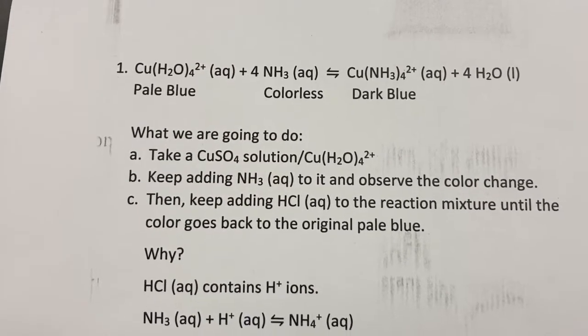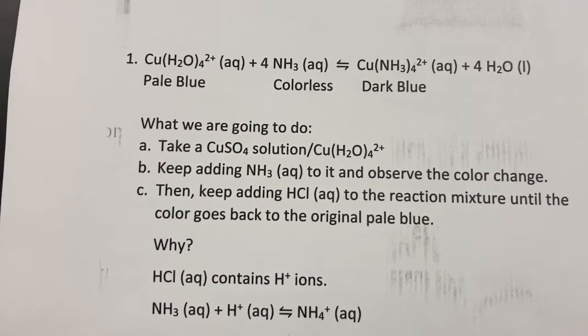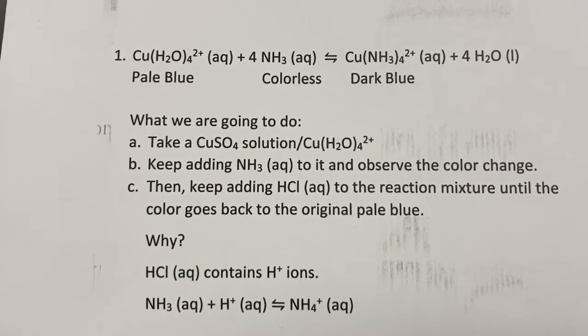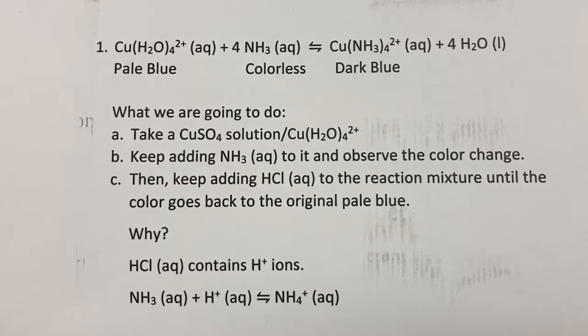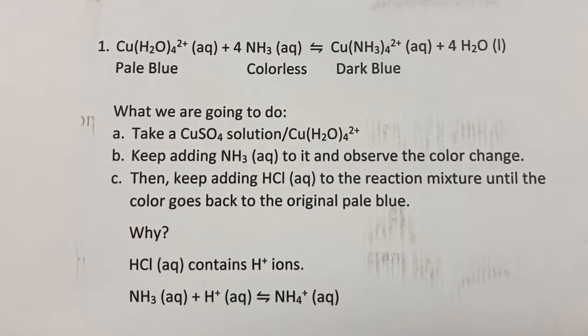So if we perform this reaction, we can predict how a change can affect the direction of the reaction by observing the change in the color of the system.